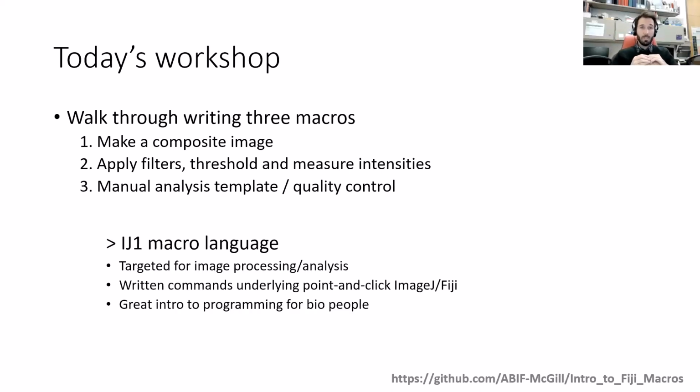And so we'll be doing this in the ImageJ macro language. In ImageJ, you can write in other languages, including Java and JavaScript, which are well supported. You can also write in Python and in R, but it's not quite as well supported. If you're learning this from scratch, or early on, beginning with either programming or image analysis, I highly recommend using ImageJ just with the macro language, unless you already know Java or JavaScript. If you're interested in learning Python and R, I highly recommend it as well.